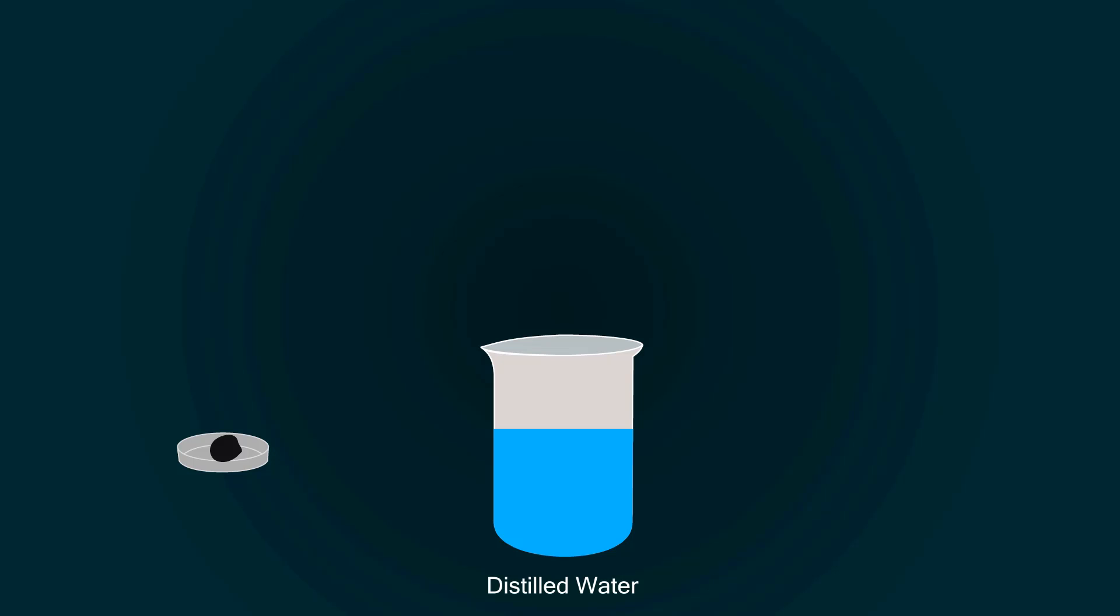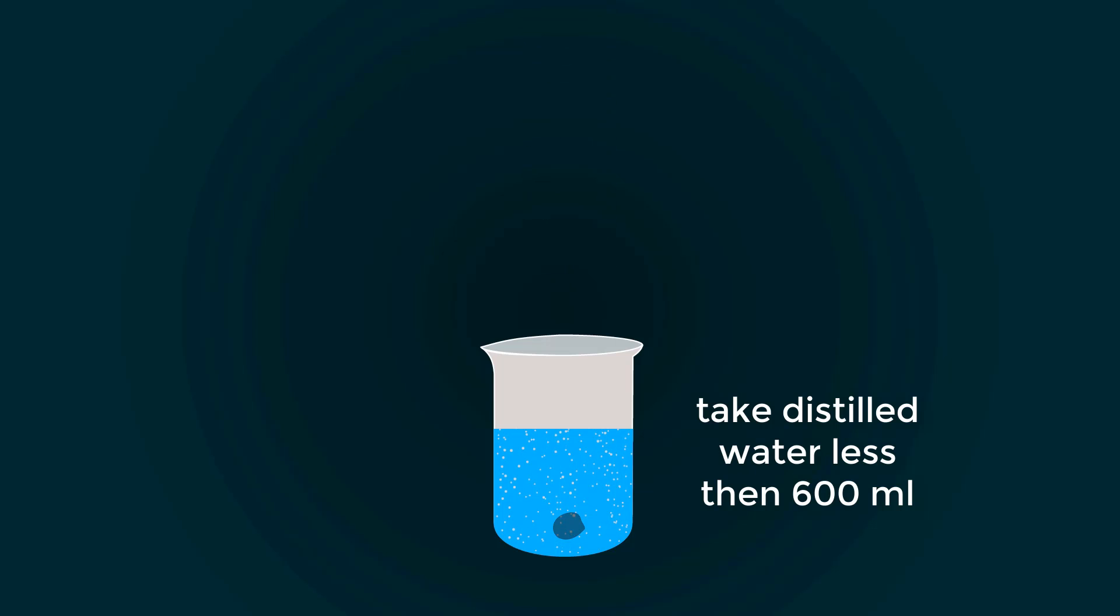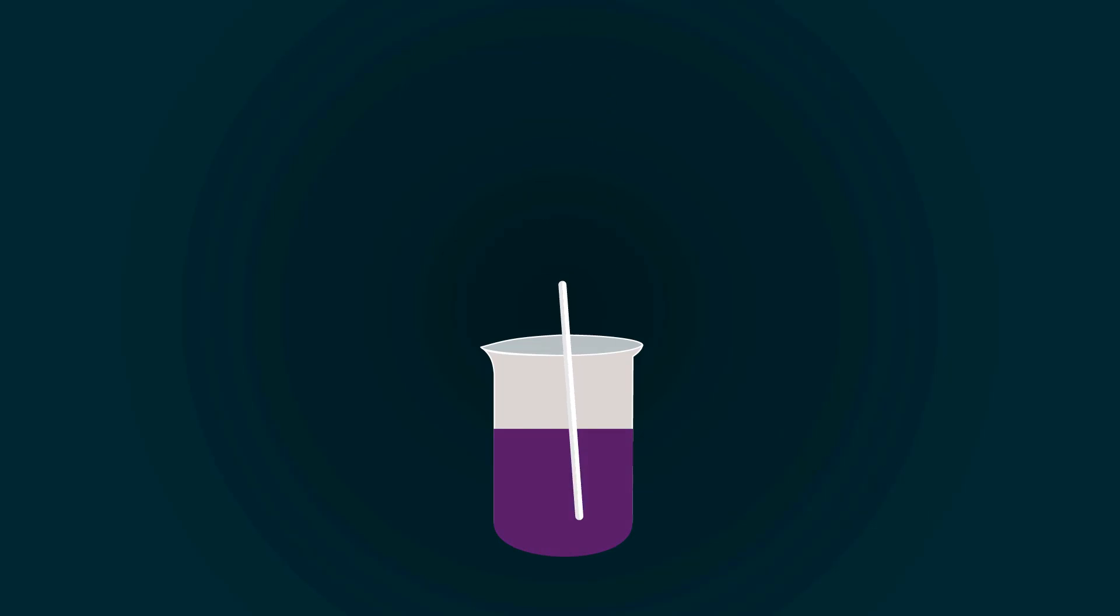Now add the potassium permanganate into the distilled water. You can take distilled water up to 600 milliliters for mixing. You have to make homogeneous mixture.